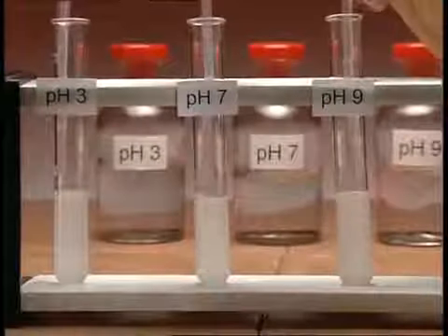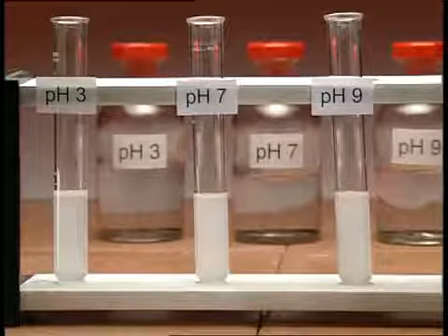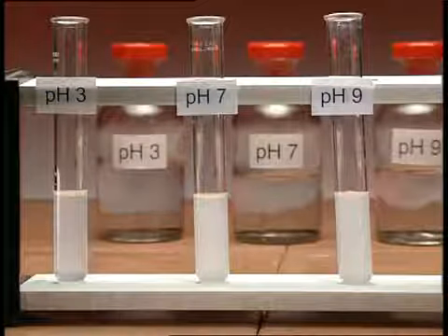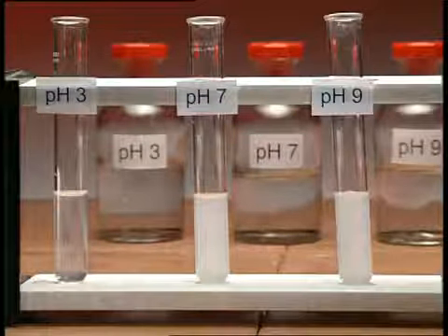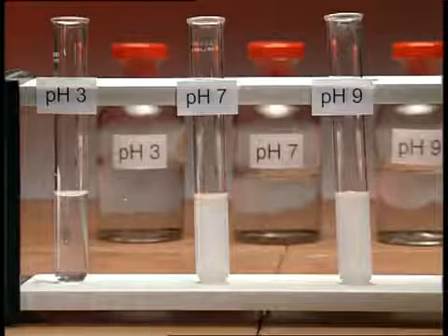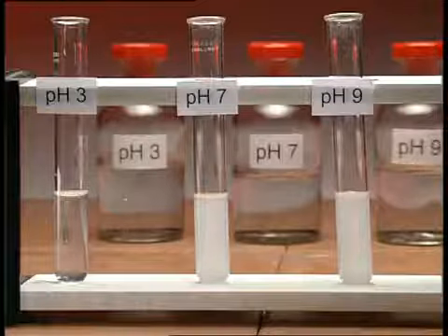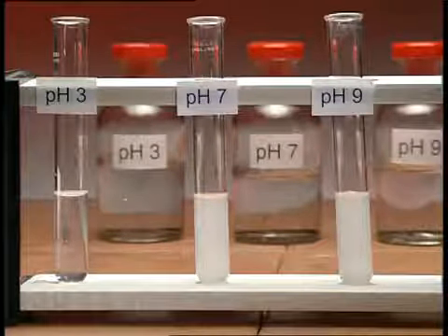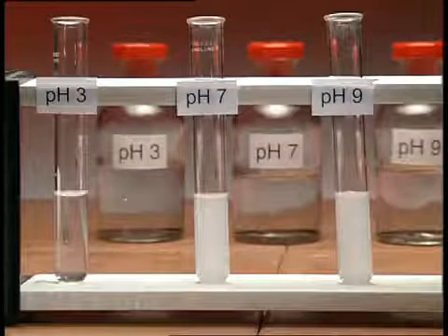The same amount of pepsin is added to each. As the egg white is digested, it'll change from a cloudy suspension to a clear solution. The solid particles of egg protein are broken down into smaller soluble particles. The test tube with acid is the only one which clears. In our experiment, the optimum pH for pepsin is pH 3. This is the pH in the stomach due to hydrochloric acid.